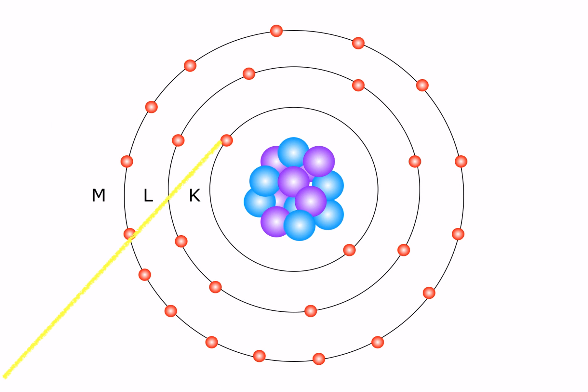Now, what we do is we send a photon in with a characteristic energy, diameter, wavelength, however you want to call it, that works exactly right for a given electron in a given orbital. And this photon and electron meet up and become the same essential thing. We now have a highly energized electron. Now, what's interesting is a lot of people wonder, why do photons only seem to interact with electrons? I mean, most of your experiences day to day, whether you're using X-ray fluorescence or color fluorescence, are fundamentally photon-electron interactions.